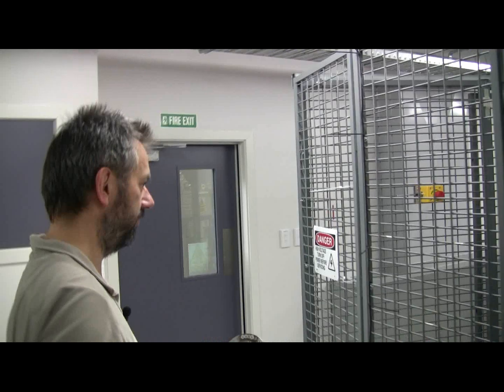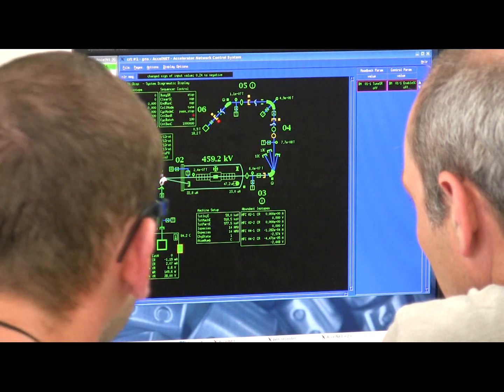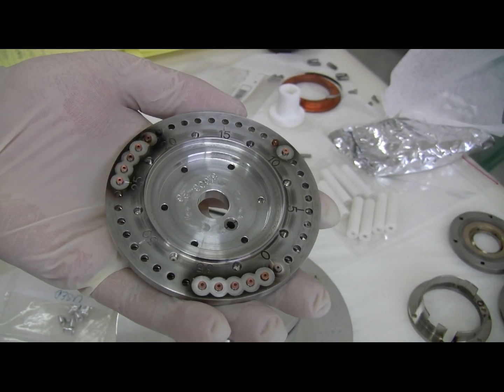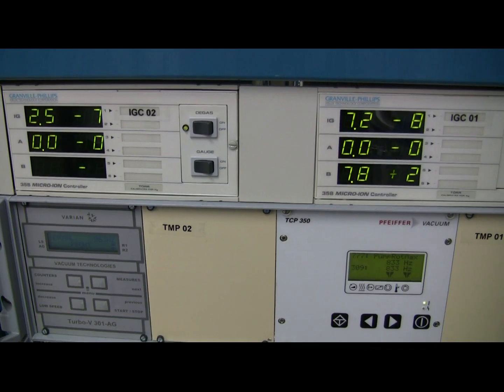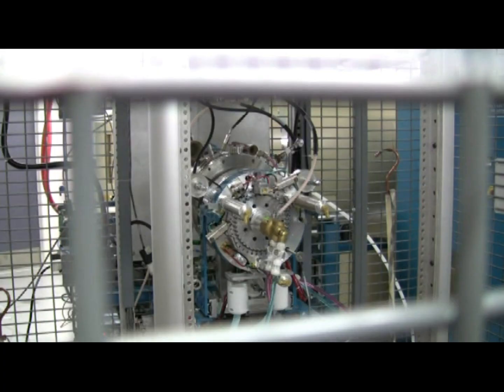And now we're taking the graphite from the sample preparation laboratory into the accelerator room for measurement. Albert Zondervan, the accelerator operations team leader, and his team take over the measurement from this point on. The graphite is pressed into an aluminum target holder, and that target holder is placed into this wheel, which has 40 positions on it. In the wheel, 25 of the positions are unknown samples, and the remaining positions are graphites that are made from standards and blanks, materials that allow us to determine our quality assurance and how to calculate the age. At this point, the wheel is placed into the ion source.